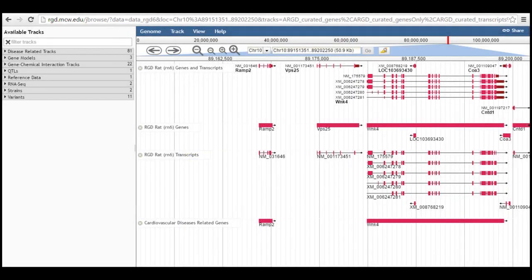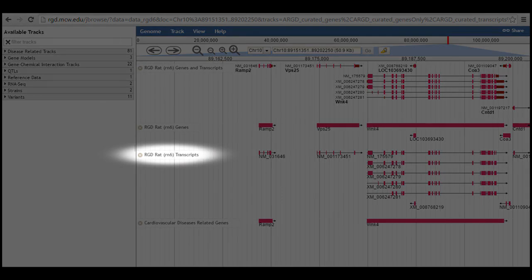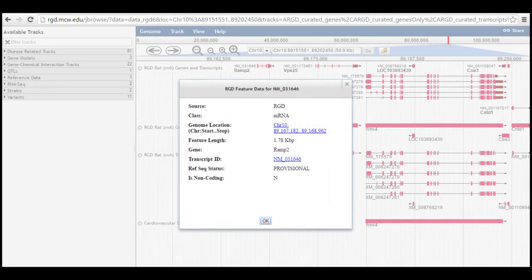The pop-ups show information specific for that data type and the object that was clicked. For instance, in the transcripts, only track clicking one of the transcripts brings up information about that particular RNA.